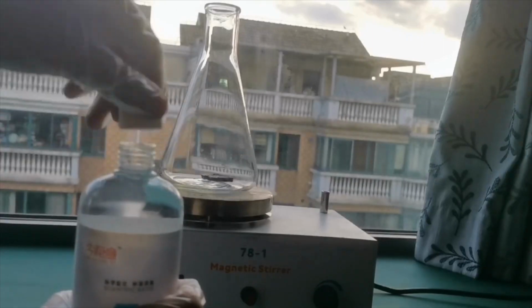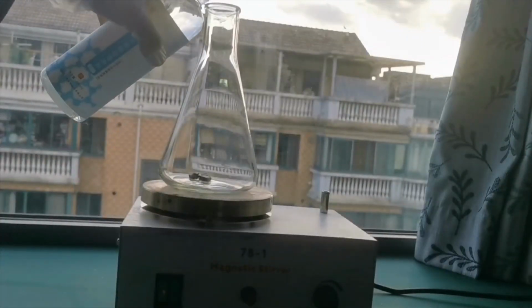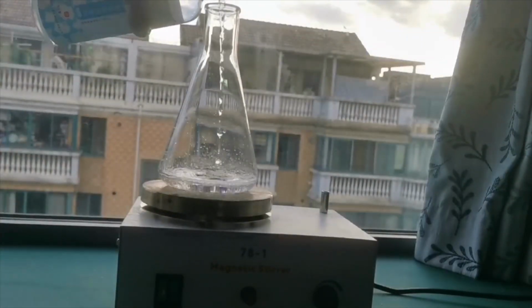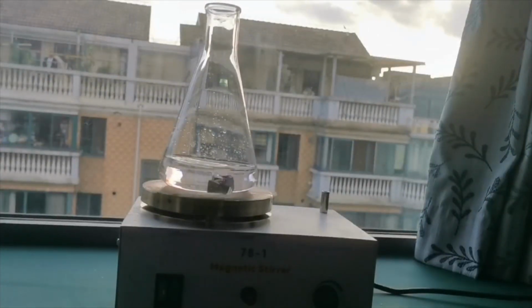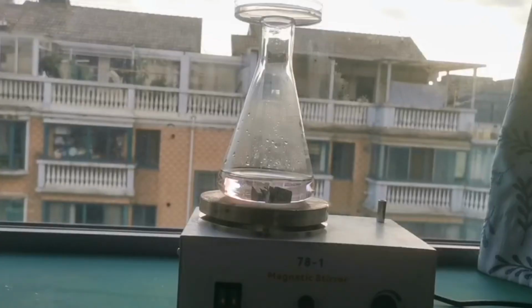I loaded the magnet into a conical flask, added around 150 ml of 30% acetic acid, and the color quickly turns pink. I then heated the flask on a hot plate to make the reaction go faster. I chose acetic acid because it was the only acid I had on hand, and also it makes the subsequent extraction steps a little bit easier. Looking back though, this decision was very, very bad. The dissolution of the magnet was extremely slow, and it took over 3 weeks to dissolve half of the magnet.